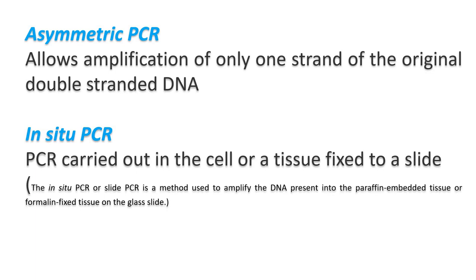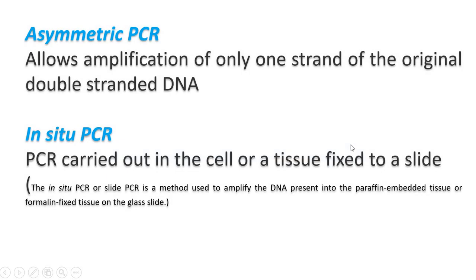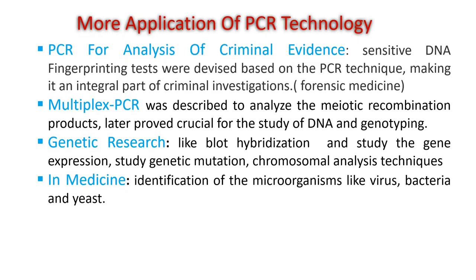والإنسايت PCR صراحة هذا كلش مهم وصراحة ممكن يعني واحد يفكر بيه بال future research work لأنه the PCR technology or techniques or steps are carried out in the cells or tissues embedded in paraffin sections يعني fixed to the slides, either formalin fixed or paraffin embedded tissue on the glass slides. يعني نطبق ال PCR steps على السلايد اللي هو containing، خلينا نقول، ال tissue present on the slide. هذا هو كلش مهم. So this is the last slide regarding the types of PCR techniques.